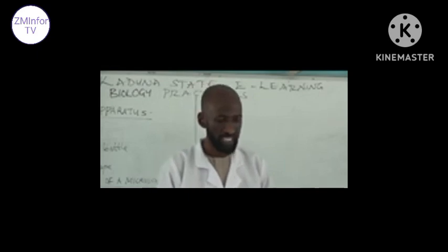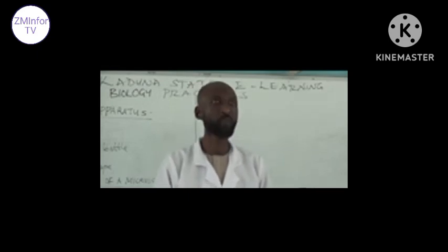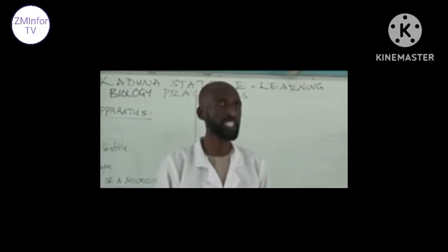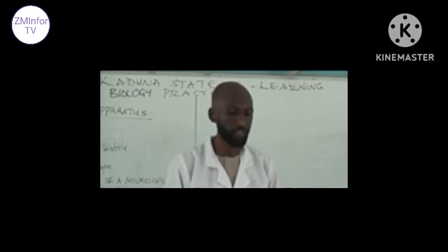Now, before we move on to the practicals, I would like us to introduce some of the laboratory apparatus to our students so that you will be familiar with these apparatus and their usage as well. Now, in every biology laboratory, there are certain materials or instruments or apparatus that are required for the conduct of practicals. These apparatus include the beaker.